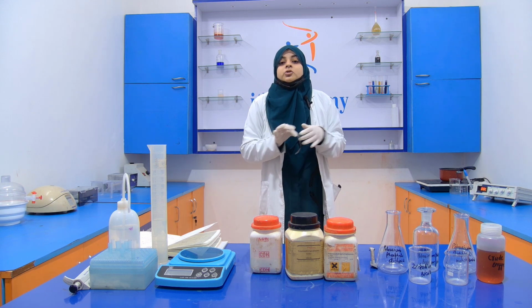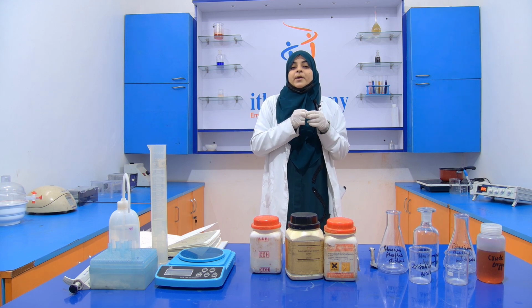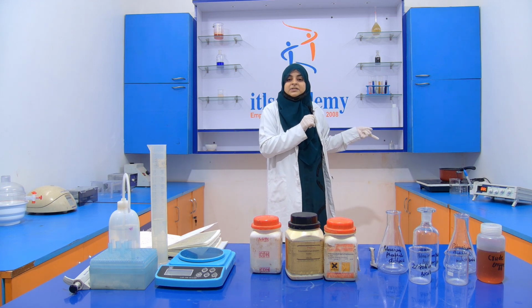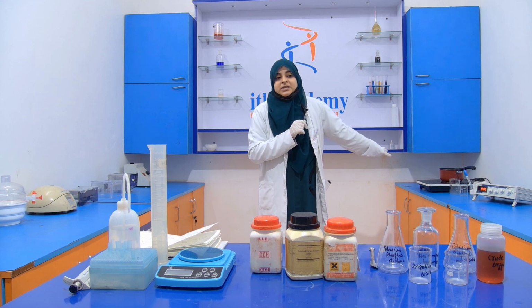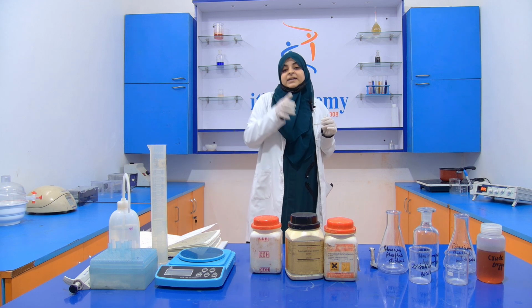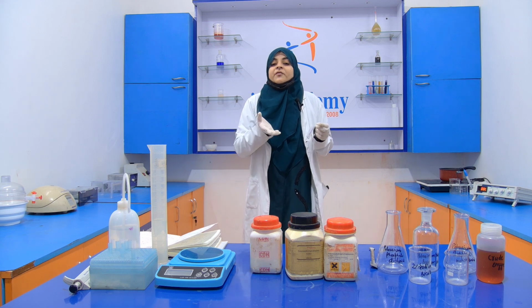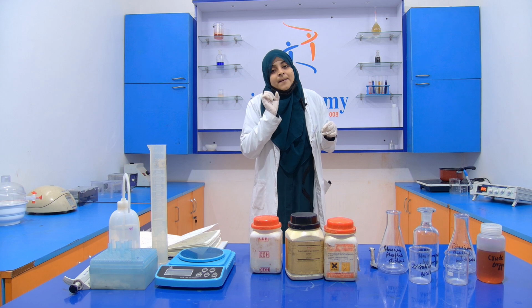For the activation of this dialysis membrane, we dip it inside distilled water at 100 degrees Celsius, meaning boiling distilled water, for 10 minutes. Then after 10 minutes, we transfer this dialysis membrane into 2% sodium bicarbonate and again boil it for 10 minutes.